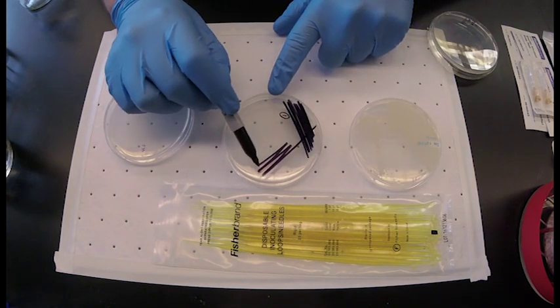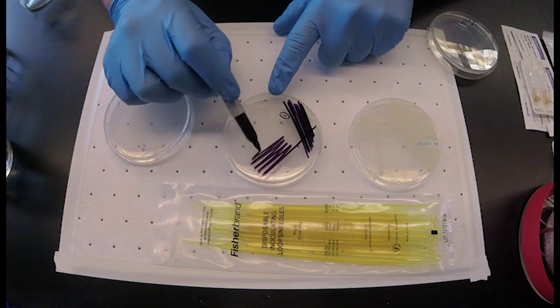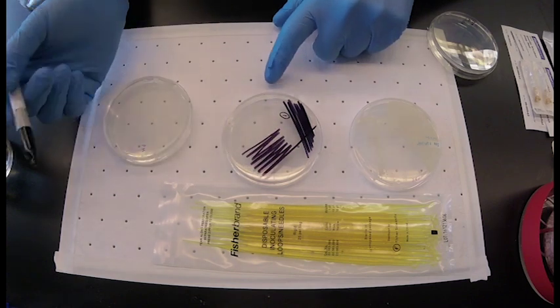Now rotate the plate and streak again through the first area. This will dilute the bacteria further.